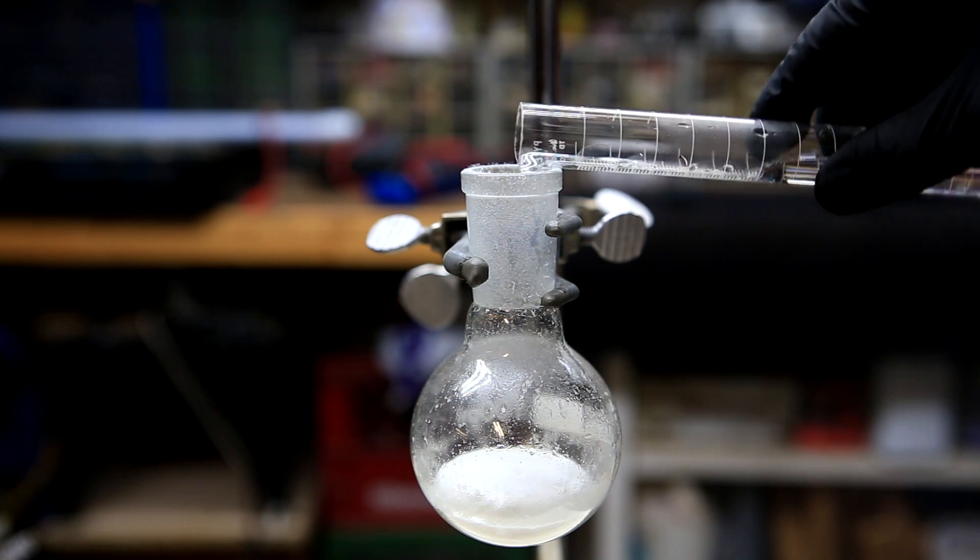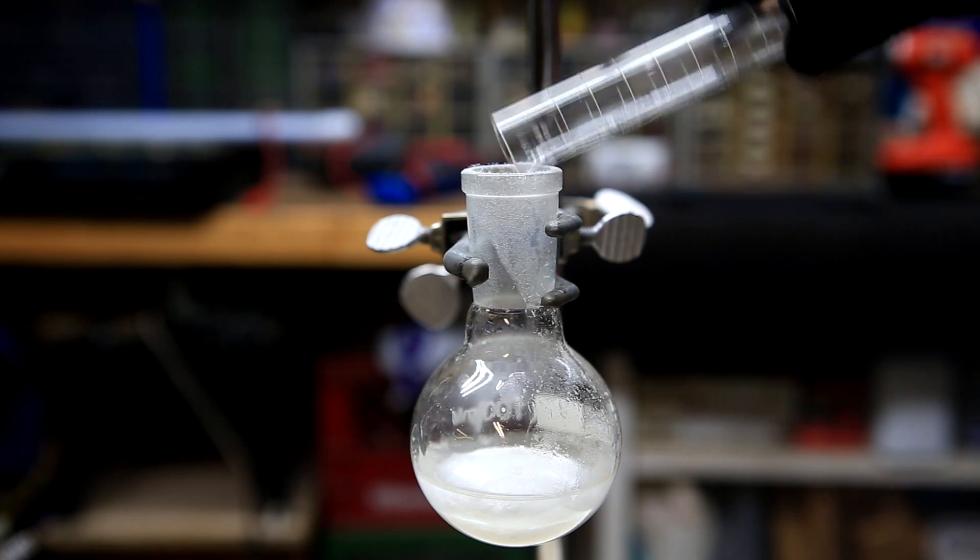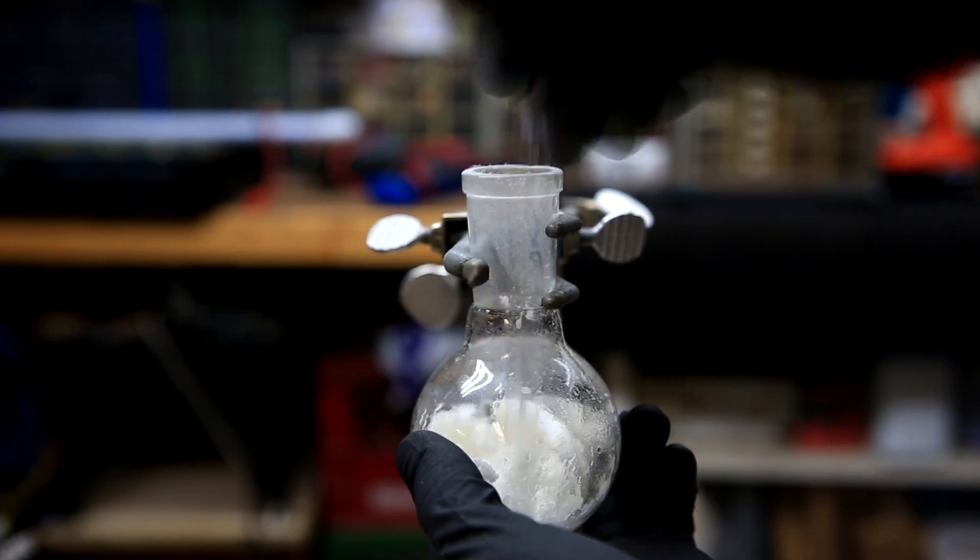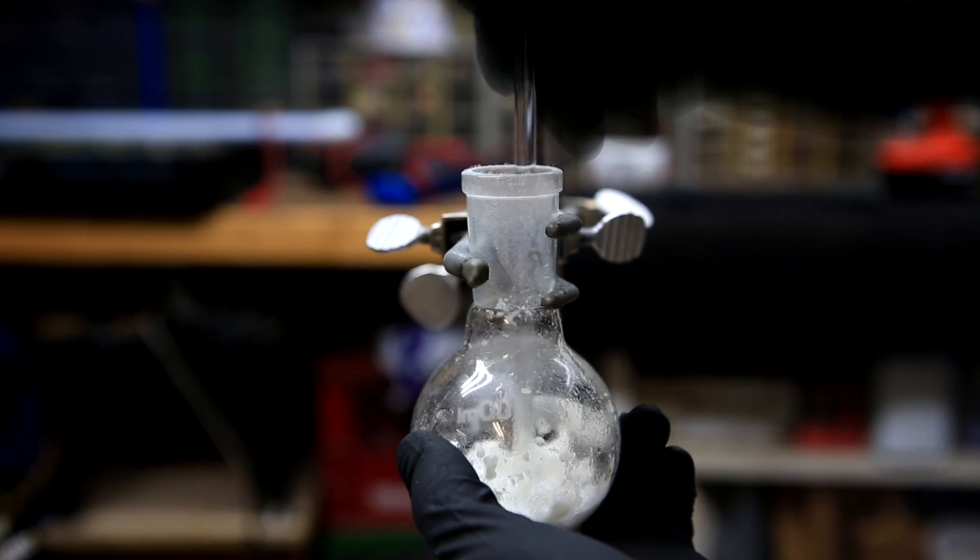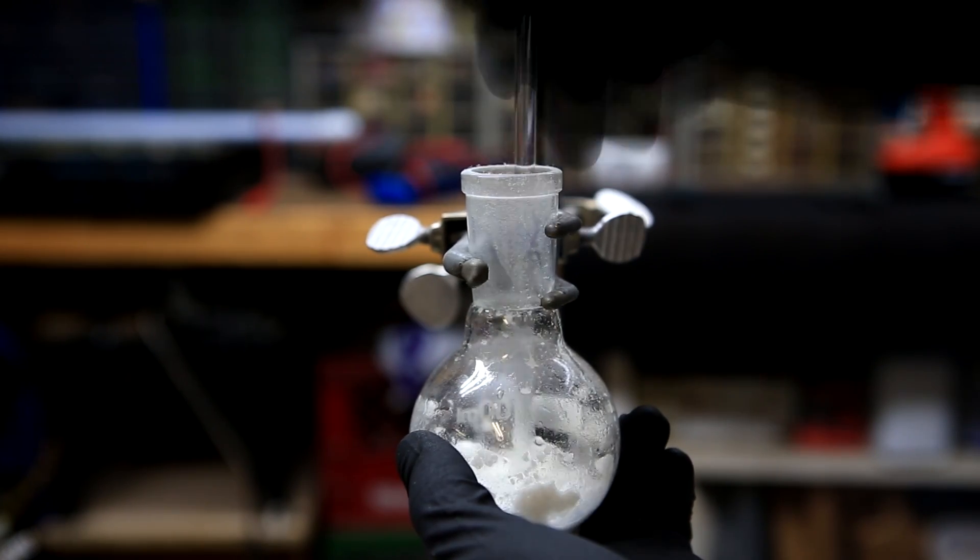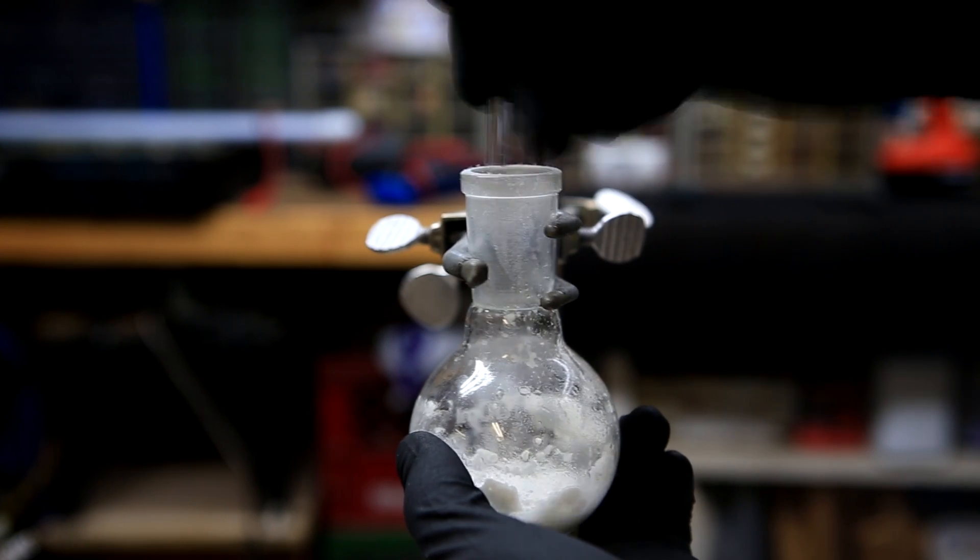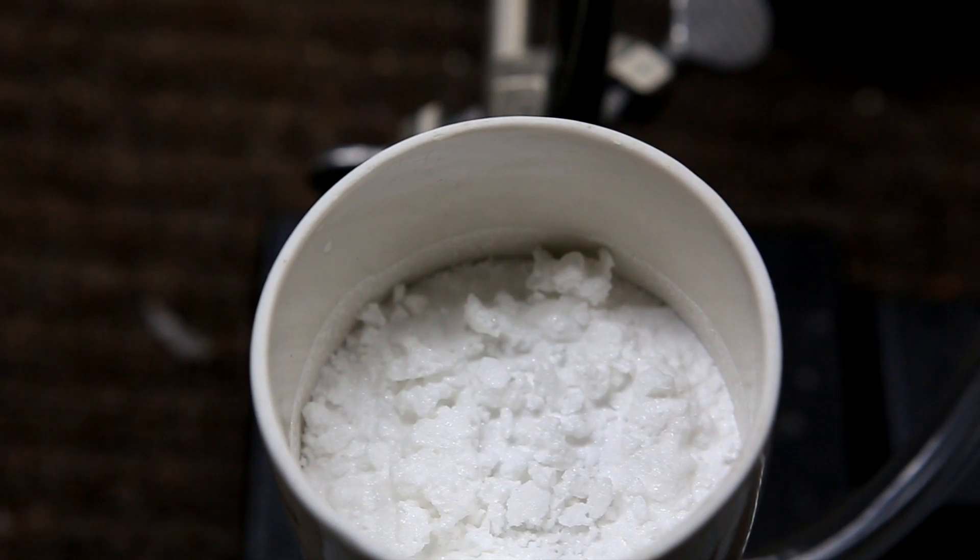10 milliliters of cold distilled water is then added. Using a glass stir rod the solids are broken up and mixed with the water as much as possible. What we're doing here is trying to dissolve any unreacted urea as phthalamide is almost completely insoluble in water. It is then vacuum filtered and dried under vacuum and we're left with our crude phthalamide.